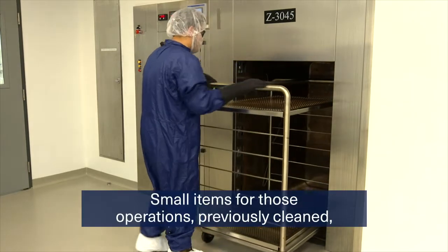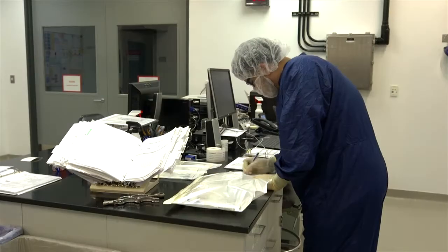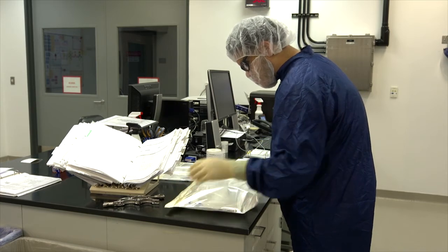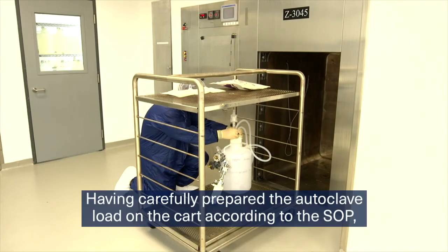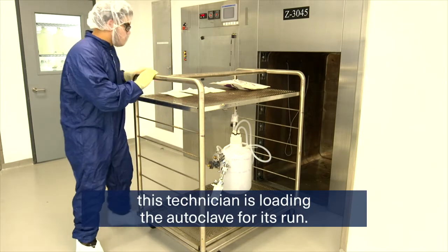Small items for those operations, previously cleaned, are sterilized in an autoclave. Having carefully prepared the autoclave load on the cart according to the SOP, this technician is loading the autoclave for its run.